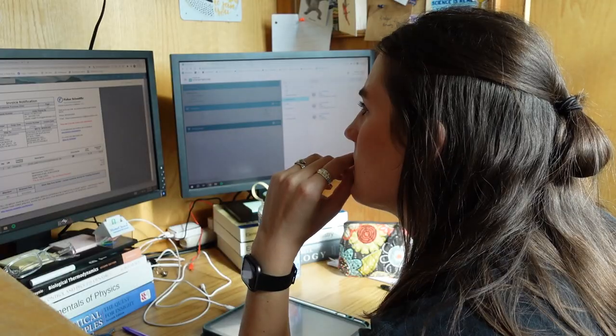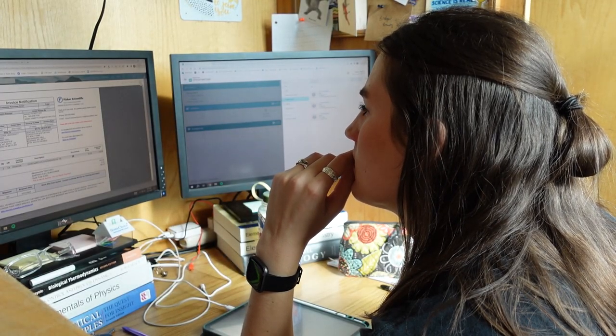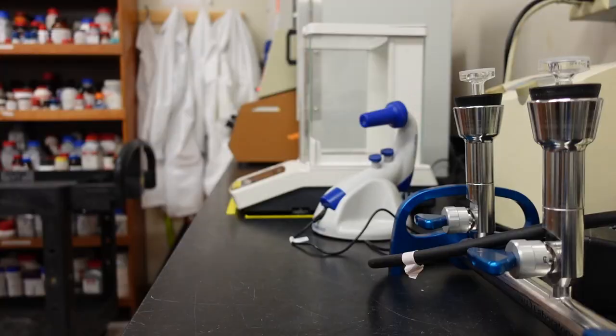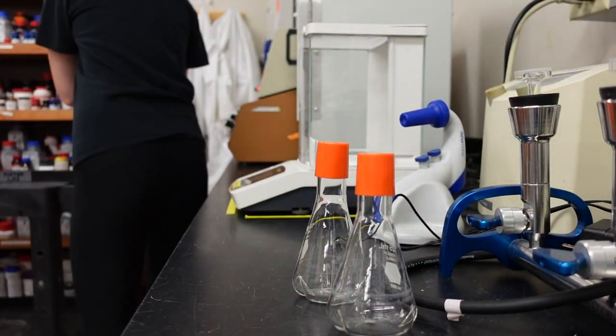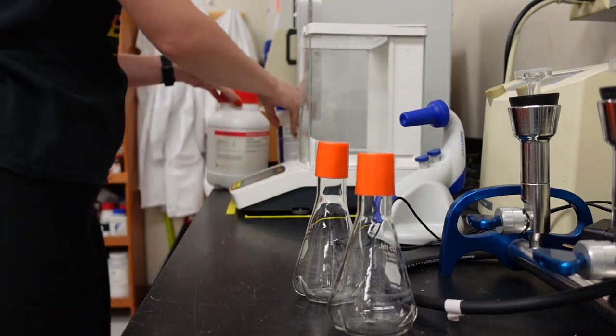After looking at my to-do list, I decided to start off with one quick, easy win, and that was submitting finance reports on Chrome River. I was able to get that done quite quickly and then made my way down to the lab to make some flasks with nutrient broth so that I could get some organisms inoculated.